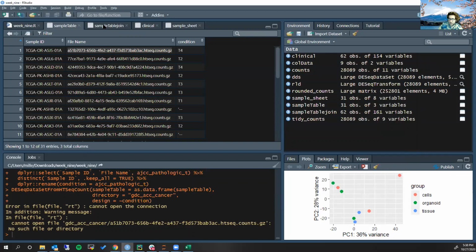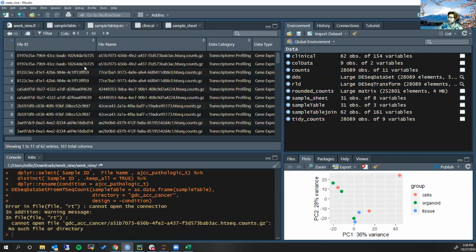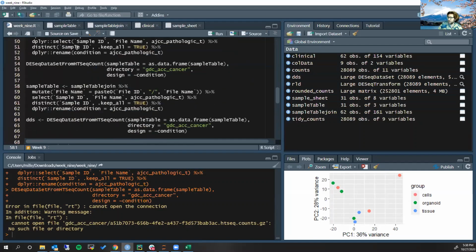There are a few ways I can handle this, but the easiest one, if we recall, is probably just to tell it where this folder is. Because remember, this folder corresponds to this file. So if I go inside this folder, I'll find this file. So in the file name, I could give it this folder slash this file. Then it'll be able to find the file within that folder inside my larger parent directory. So that's what we do here.